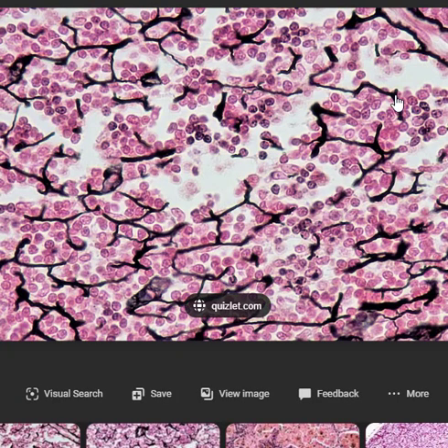I like this picture of reticular connective tissue better, I think, than the one in the lab manual because they use a different stain. The one in the lab manual uses a brown stain, and this one actually causes the reticular fibers to show up as black. And the reason I like that is because I know that when we talked about endoplasmic reticulum, we talked about ladies' purses.